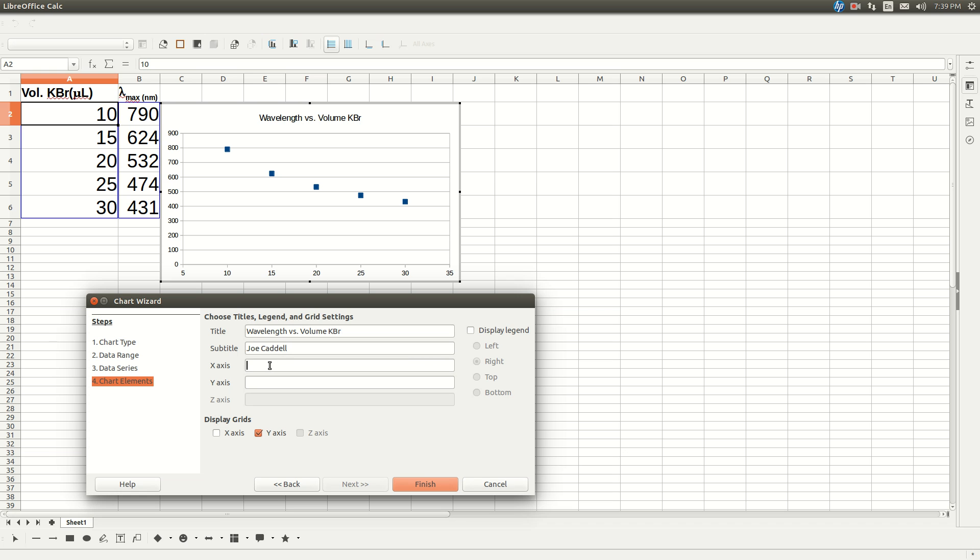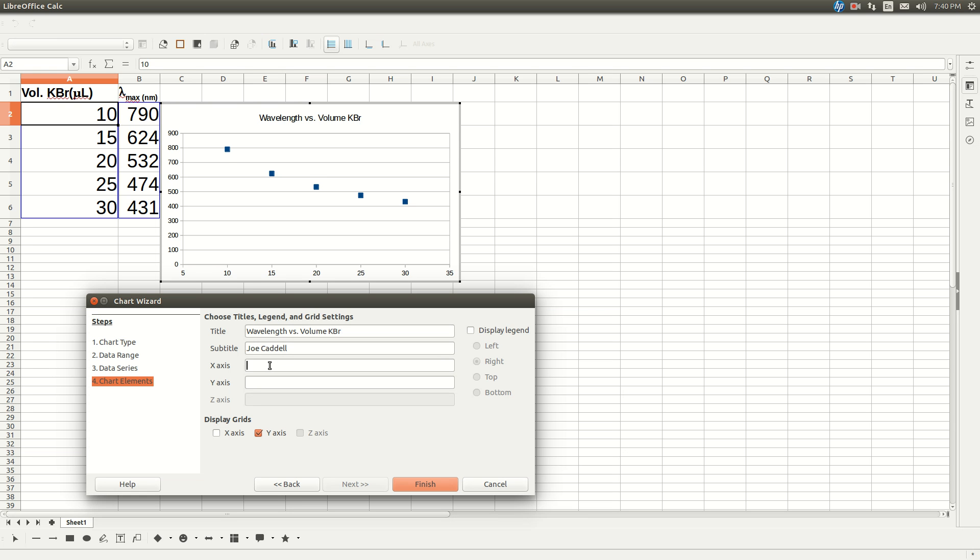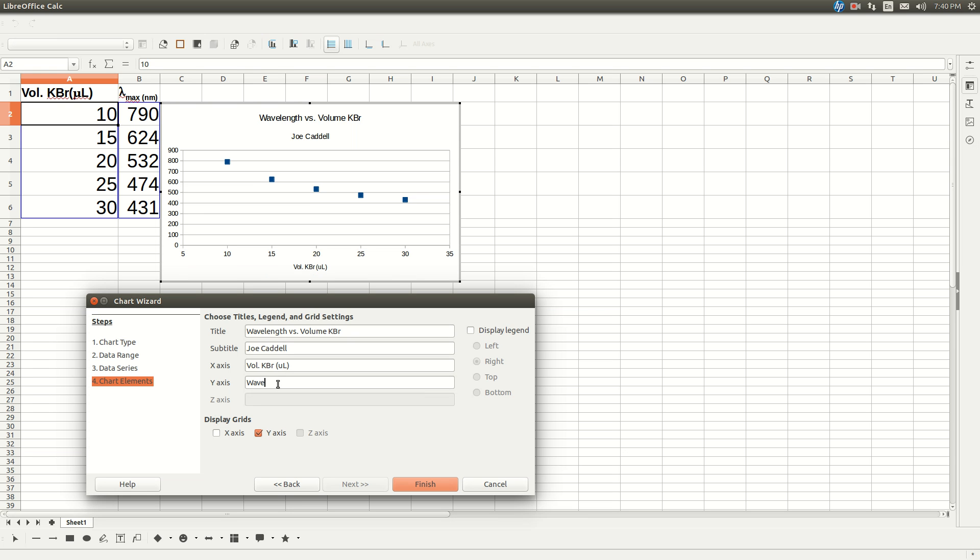X-axis is volume of KBR in microliters. And Y-axis will be the wavelength of maximum absorbance, lambda max, and that's in nanometers. Click on the X-axis box so that both X and Y-axis are shown.